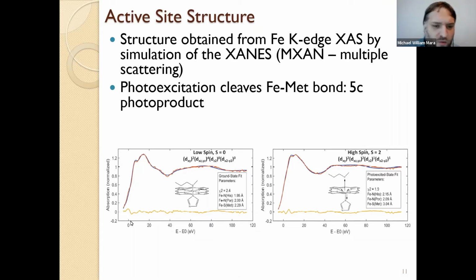So there's a peak on the rising edge that we miss because this is some kind of p symmetry electronic transition, but we generally reproduce the shape of the XANES quite well, including the little shoulder here and the general intensity of the two peaks that are out here.